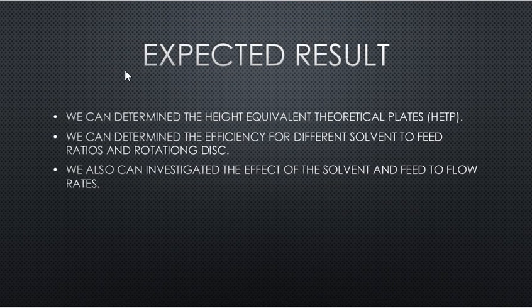After we run the experiment, there are some expected results that we can obtain. The first one, we can determine the height equivalent to a theoretical plate, HETP. We can also determine the efficiency for different solvent to feed ratios and rotating disc speeds. And the last one, we can investigate the effect of the solvent and feed flow rates.